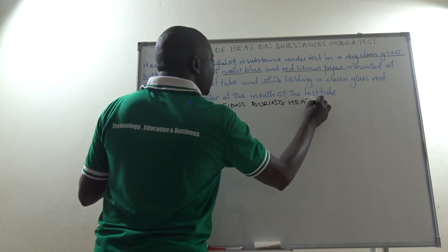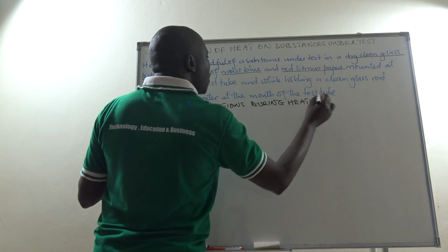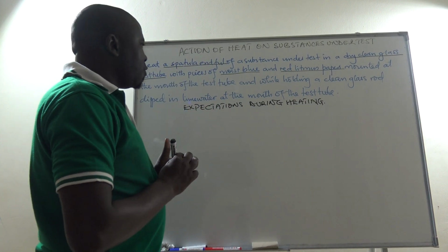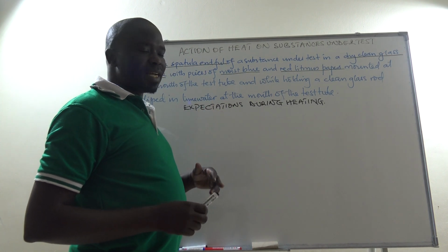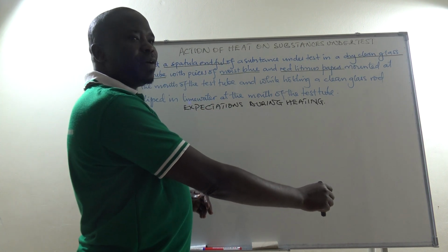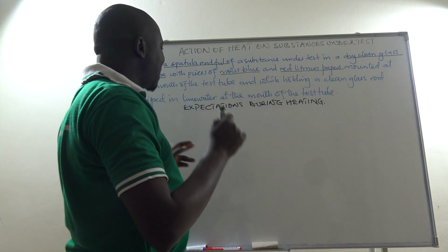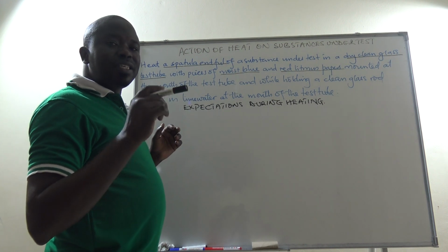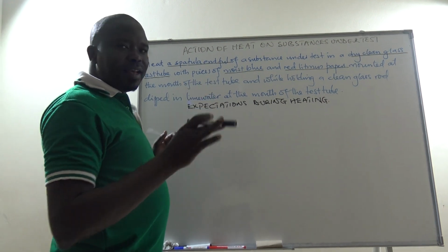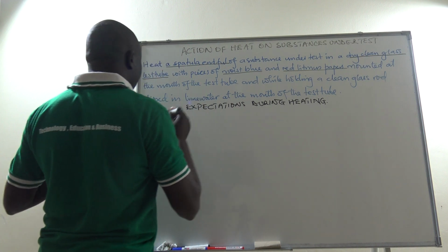Most candidates simply go and heat without any motive. So you ask yourself, what could be the rationale of heating that substance? If you just go and stand and heat without minding about what is taking place here. So you must have some expectations during heating. You don't just heat anyhow. So we are going to look at the expectations during heating.